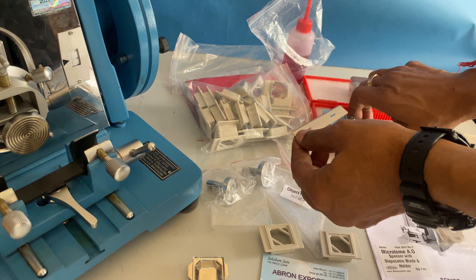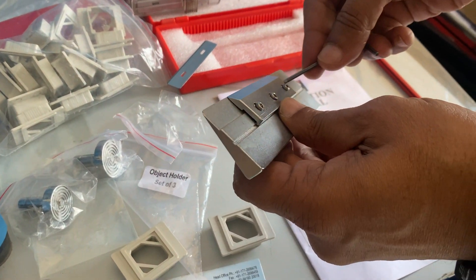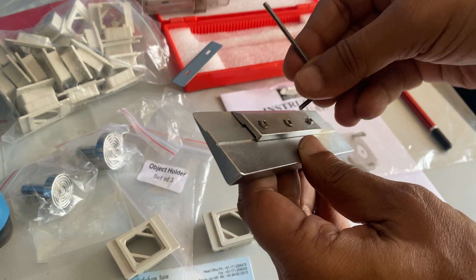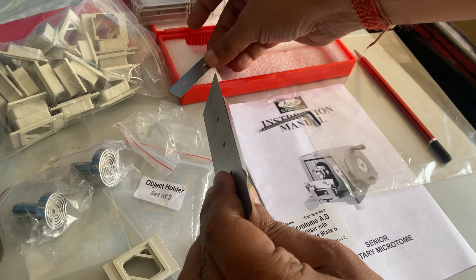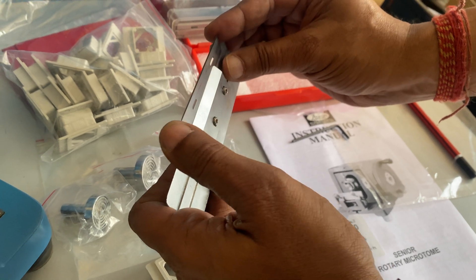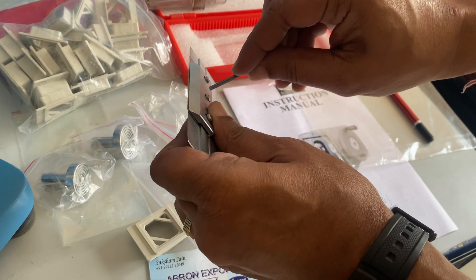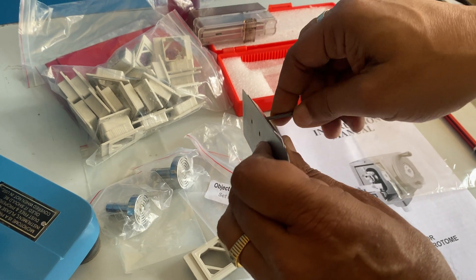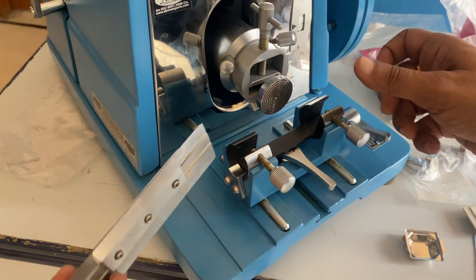Take it out and attach it with the key — this key is there. You open the section of it and release it; a gap will be created here. You can put the blade in this section and then tighten it back so that it is secured properly. I am just showing you a sample of it — you should tighten it properly.